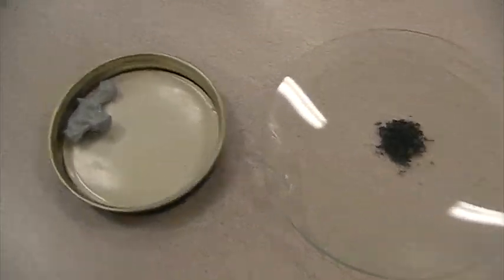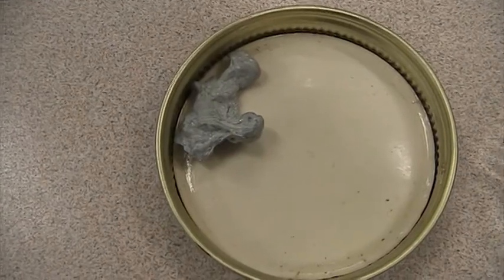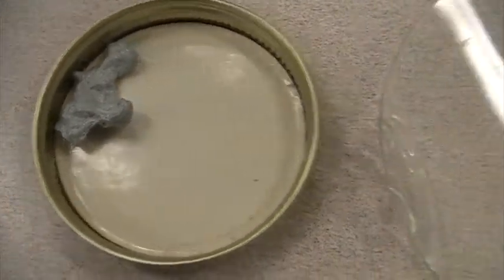Here we're looking at the reaction between zinc, which is this silvery metal used in galvanized steel to prevent rust, and iodine. These are solid iodine crystals. The stuff you use to heal wounds is usually in something called a tincture, mixed in with water.